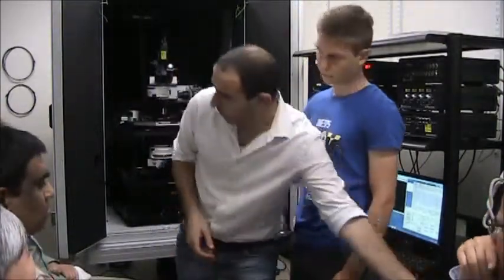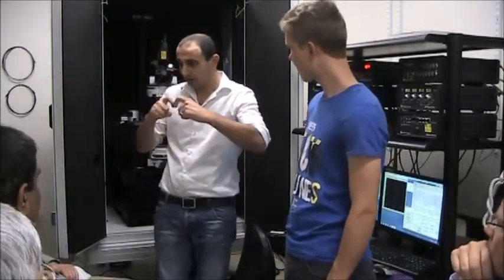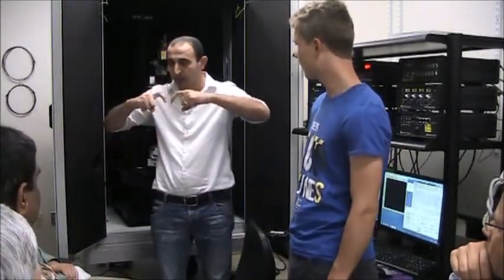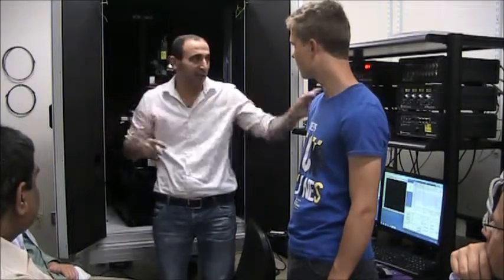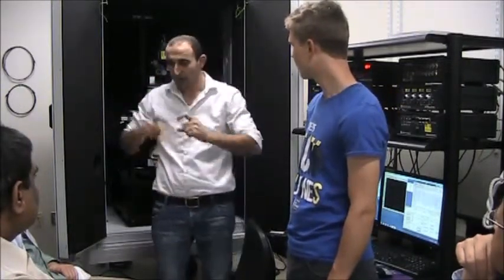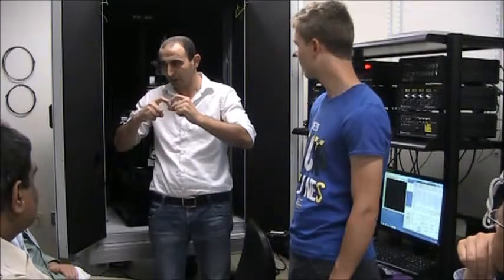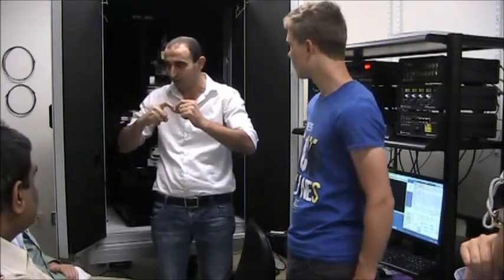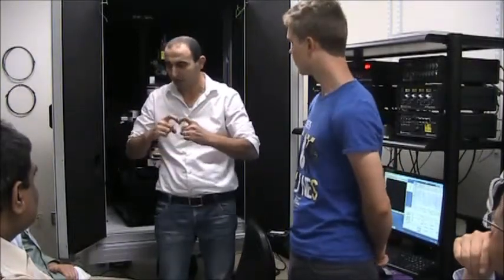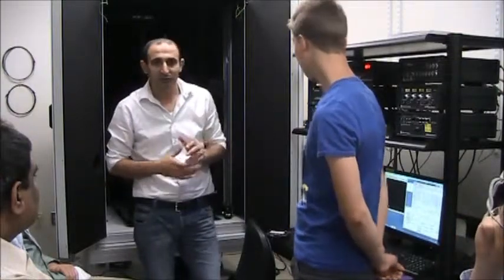How close do you typically get the NSOM probe? Touching. Yes, because when they are in feedback with the sample, you have a Z feedback level which you can easily see and monitor with the system. So when you bring them, when you offset the tip, you will see that the Z feedback starts to change. They start to feel each other. So you know that this is the point where they are touching each other. So this is what we were doing till now in the morning.